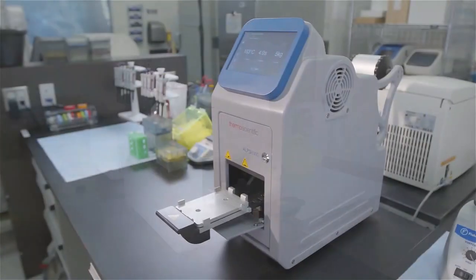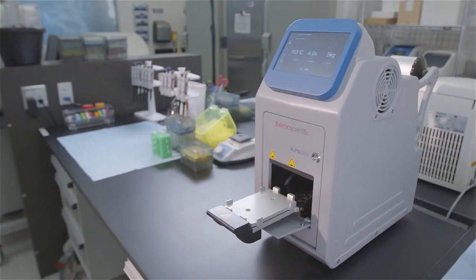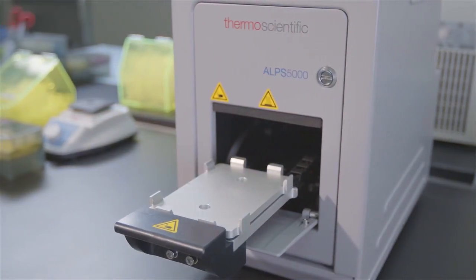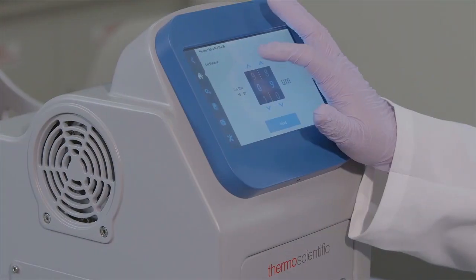Introducing the ThermoScientific ALPS 5000 automated plate sealer, offering mechanically operated plate sealing with advanced process customization.